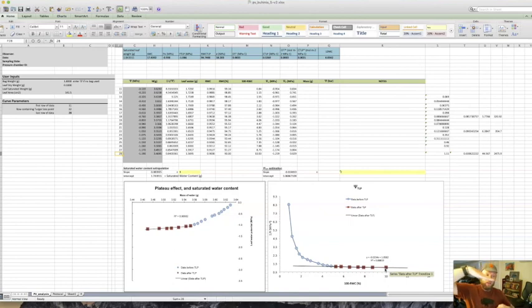Remember, it should be this negative slope all the way as sugar concentration is getting higher and higher, and so we should continue a linear line. If it flatlines or starts going up, something has happened inside that leaf, and the leaf is kind of toast, and you want to get rid of those data points. The other thing that can happen is that some of your initial data points can be oversaturated, meaning that the air spaces in the leaf are actually filled with water when they shouldn't be. So if the plant doesn't normally operate with its air spaces saturated, you shouldn't start your data when they're saturated, right?